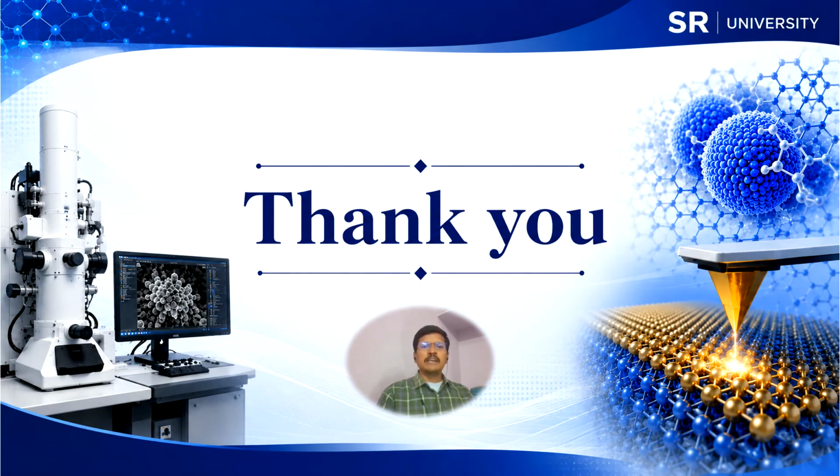XRD remains one of the most essential characterization techniques for understanding crystalline materials and nanostructures. I hope this module provides you a strong conceptual understanding and practical insight into advanced diffraction analysis.